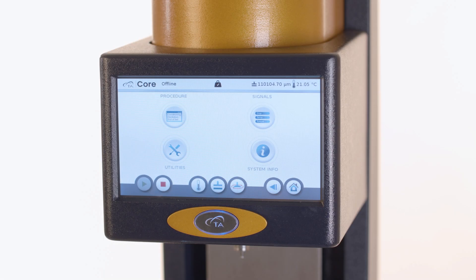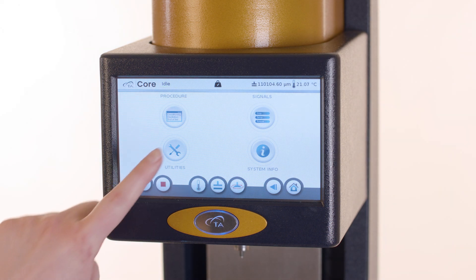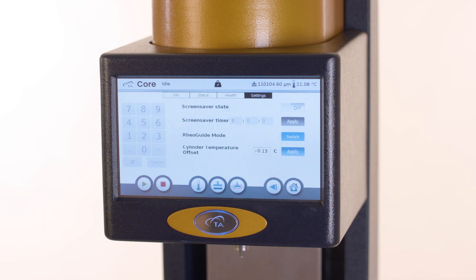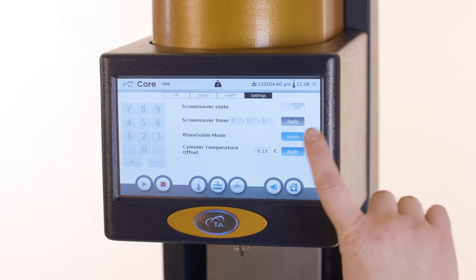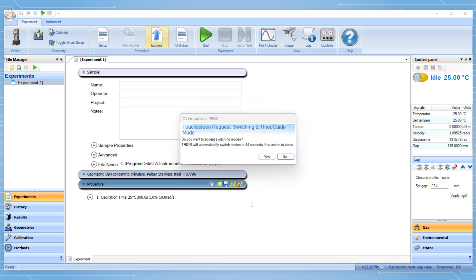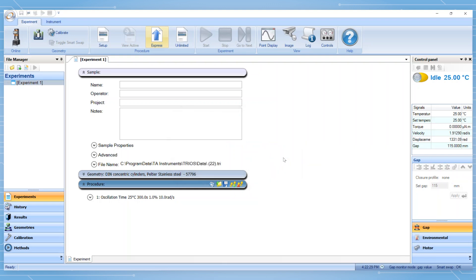To run a test in RayoGuide mode, first ensure that the instrument is connected to a computer using TRIOS. You may switch from the classic home screen to the RayoGuide home screen by navigating from utilities to settings and then selecting switch. Pop-ups display on the touchscreen and the computer screen indicating that the mode is being switched. On the computer screen, you may accept or reject switching modes. Otherwise, after the countdown, the switch will happen automatically.